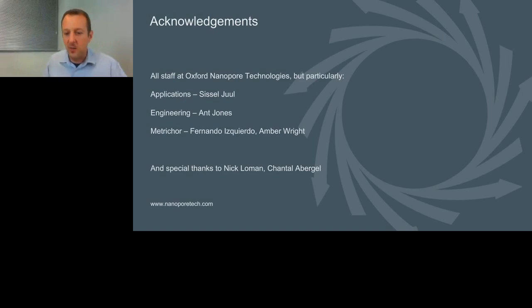What I would be confident saying, I mean, it's bioinformatics that we need to do in proper detail so we can give a proper considered opinion, especially for transcriptomics. But I think that without the amplification step, we come much more closer to having a quantitative system. Before I can say yes, it is fully quantitative, we need to validate that. But I don't think there's any reason to suspect that it is not quantitative.